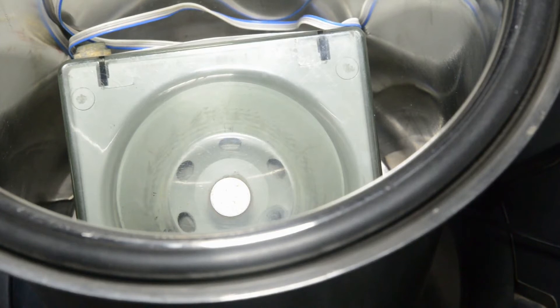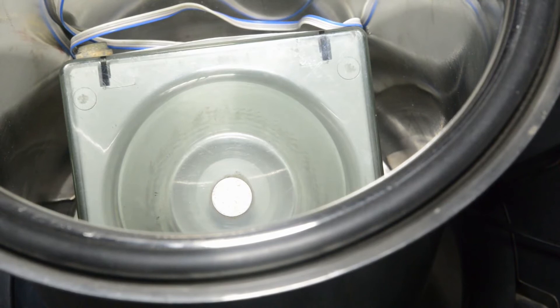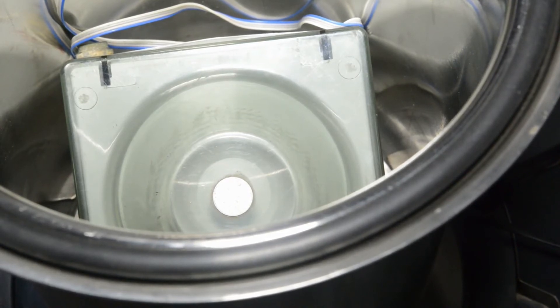After wiring, place the centrifuge and confirm that upon switching on power, its rotor is rotating. And we are ready to go.